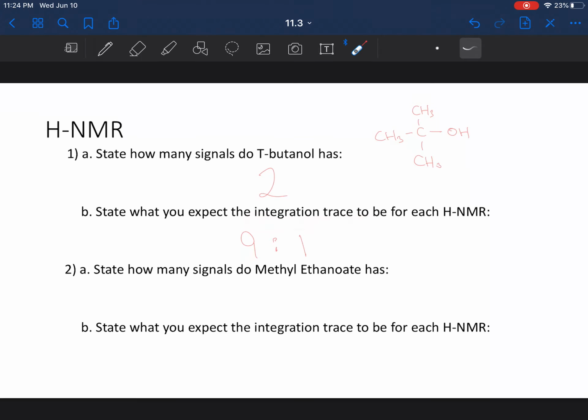All right, so maybe we should pause. You guys do the next one, and we'll take it up. All right, I'm sure you guys have already unpaused and figured this out because this stuff is not that hard, I hope. So let me pick another color to use. So let's take a look.